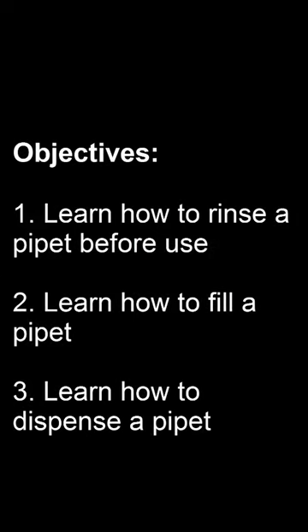Taking an aliquot. In this video, you will learn how to rinse a pipette, fill a pipette, and properly dispense a pipette.